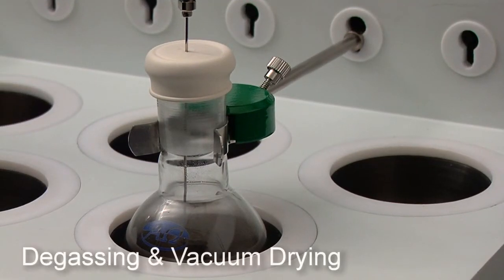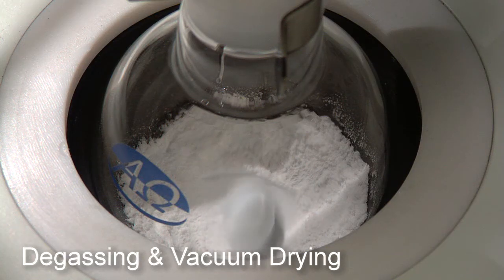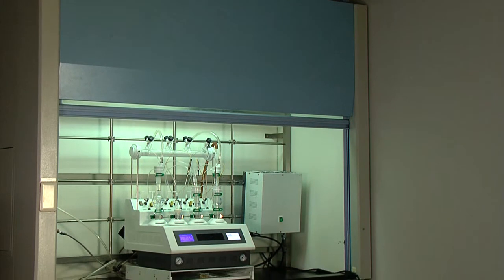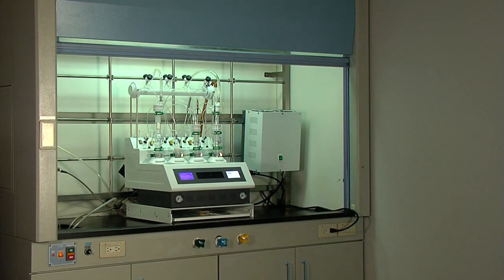You can quickly remove the moisture film from the vessel and also dry the reactant or crude product on Pro7. What's more, Pro7 carries out these functions with a compact footprint that is one-third the size of a standard fume hood.